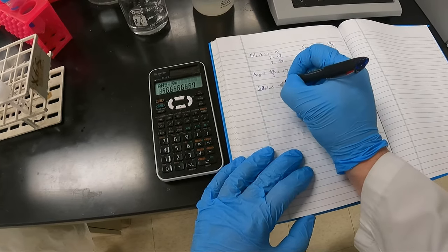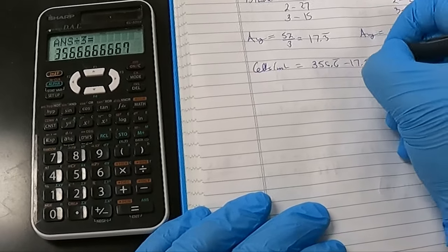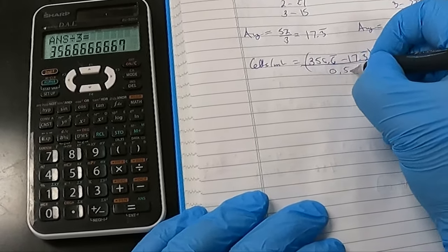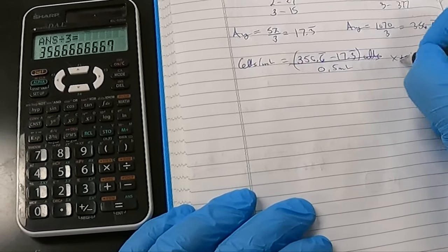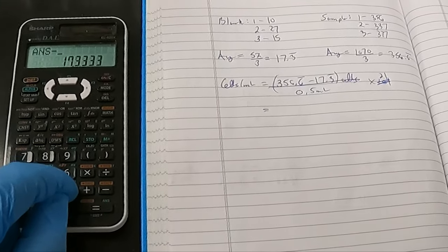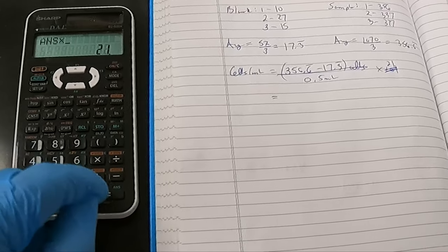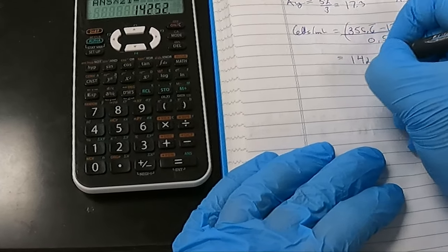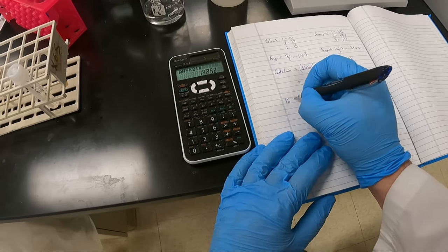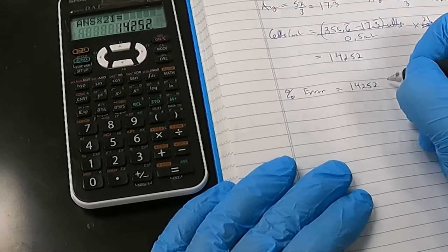Calculate the concentration. We take the average sample minus the average blank. This will represent number of cells. Divide by 0.5 mils because that's how much volume is drawn into the machine at every run. And we're doing a 21 dilution, not 101. Remember what I'm shooting for is 1.35 times 10 to the 4. Got 1.43 times 10 to the 4. Not exactly the same, but we'll see how close it is when we do our percent error calculation.